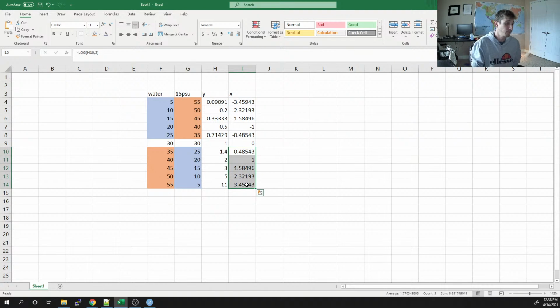But when the log fold change is positive, it means that the genes expressed in water are higher expressed than in salt water. And so you see that the intensity is the same, right? And so it tells us the direction.